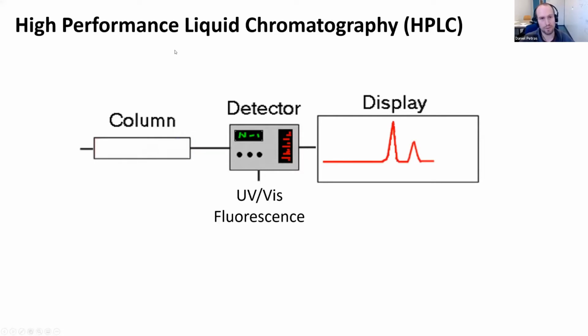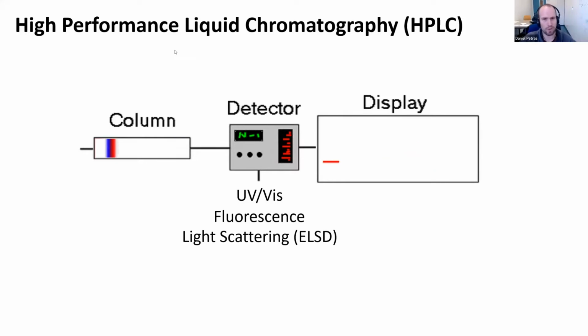fluorescence is commonly used. It's very sensitive. So for some pharmaceutical analytics, for example in production processes, this is also widely applied. Then light scattering, which is a little bit less sensitive, but has the very nice property that it's more compound independent. Whereas with UV, you for example need pi systems to get some type of absorption, but obviously not every molecule has that. So for some molecules you might be blind, but light scattering is more universal there. And then refraction is another thing people use.